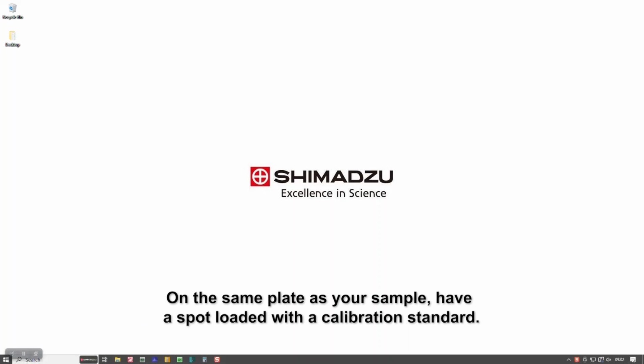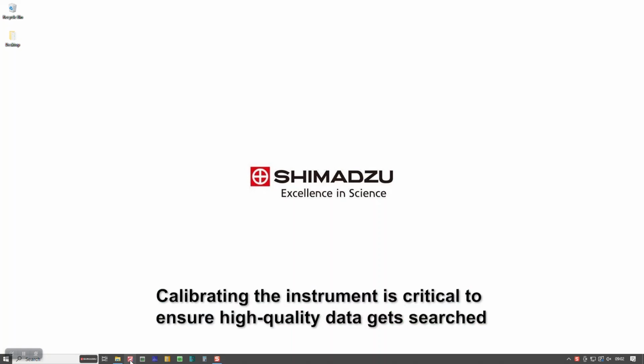On the same plate as your sample, have a spot loaded with a calibration standard such as the TOF Mix 8 peptide standard or TOF 2 mix. First, we will calibrate the instrument before running the sample. This is critical as Mascot works best when high-quality data is searched.